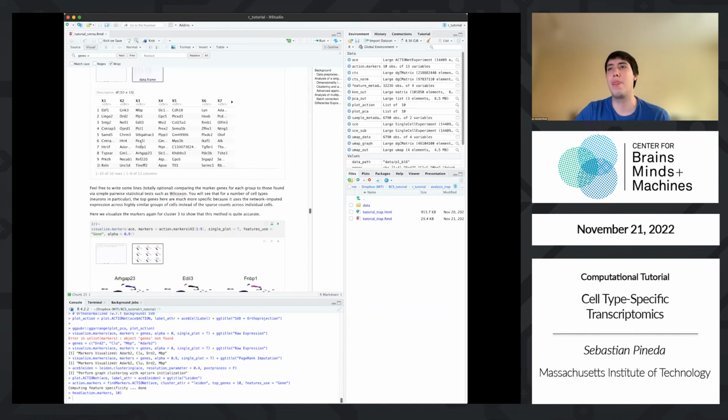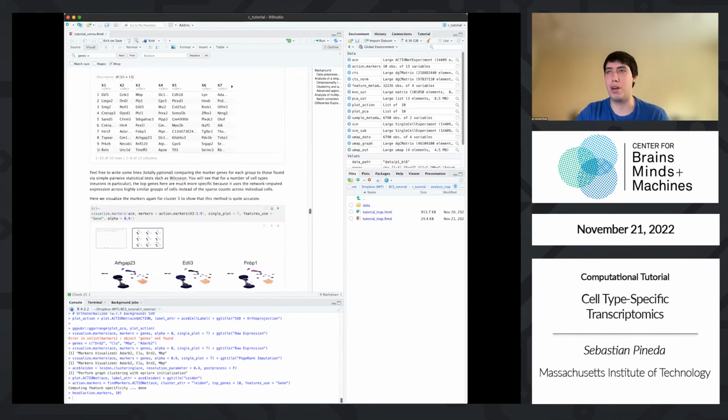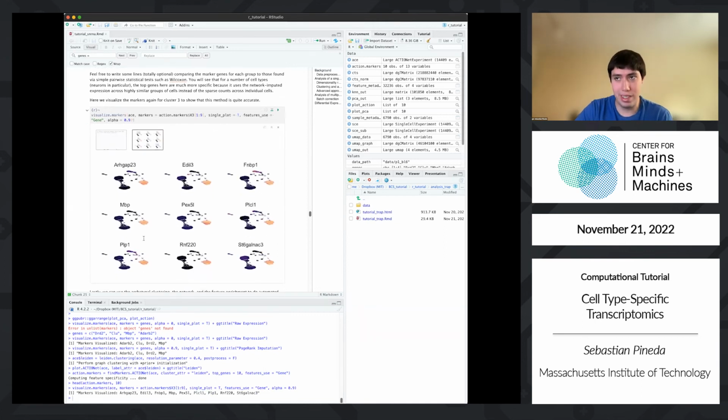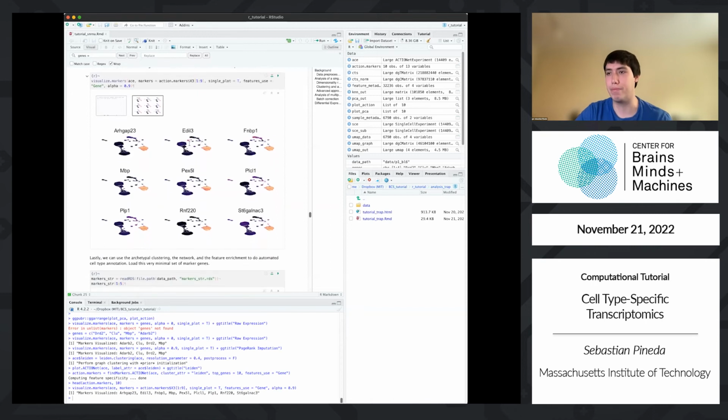Now we can pull one of these out and say, okay, plot. Not all of these are canonical markers. Some of these are de novo markers. How accurate are they? How good is our algorithm at finding new markers? Turns out it's very, very good. If we were to just plot the top 9, some of these are genes we may never have worked on in oligodendrocytes, you may have never heard of these genes, but they're extremely specific markers, right? And what it will do is give you a ranking of every single gene in the transcriptome ranked by specificity for each individual cell type. And that's very powerful for de novo marker identification.